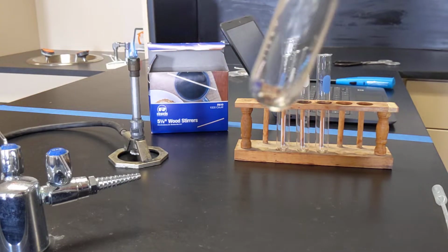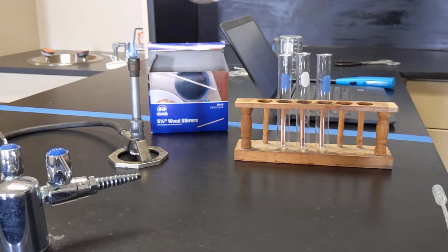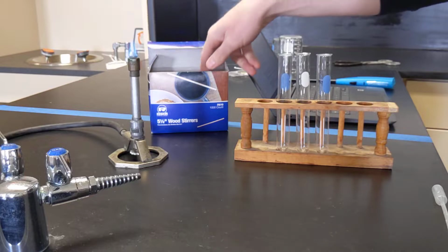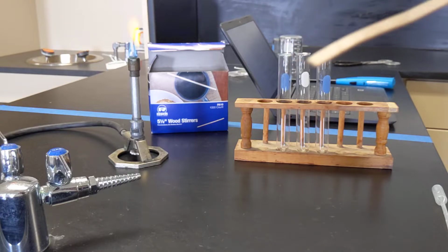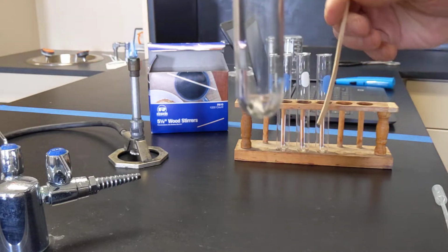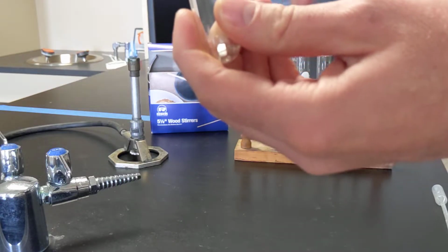There is something called the flame test that you can use to test the identity of certain gases if they're produced. So some of these reactions are going to bubble. And what I'm going to do is take a wooden splint, it's just a coffee stirrer, and set it on fire in the Bunsen burner. I'm going to blow the fire out so that it's still glowing red hot. And I'm going to put that in the test tube because the gases that are formed should stay in the test tube.